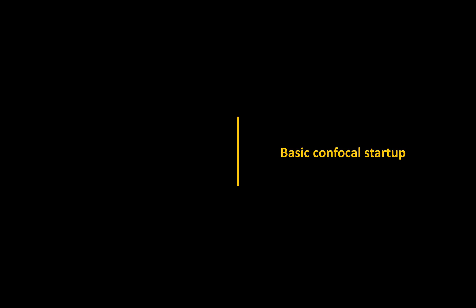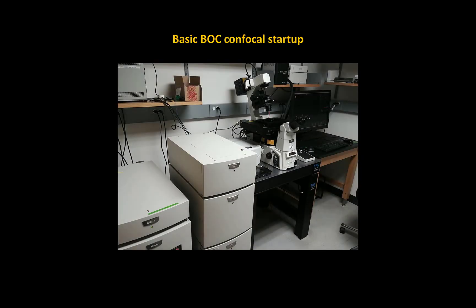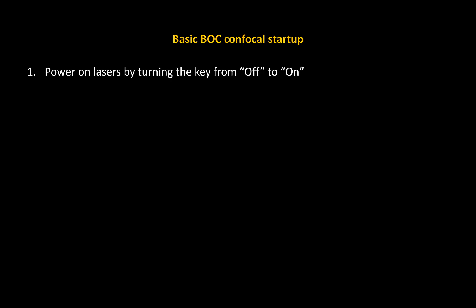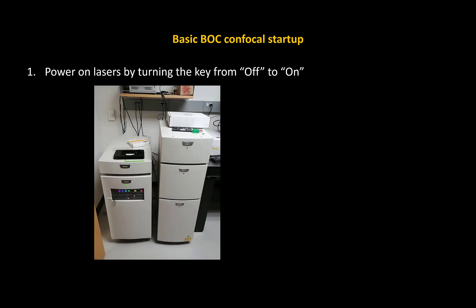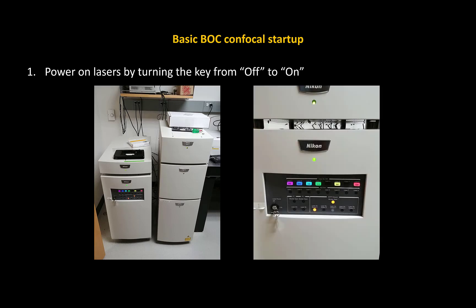Let's talk about basic confocal startup steps. This is a picture of the confocal microscope in the box. The first step is to power on the lasers by turning the key from off to on. There's a laser power key right here — just turn it from off to on. The laser buttons will light up and start blinking as they warm up. You can proceed to the next step without waiting for them to stop blinking.